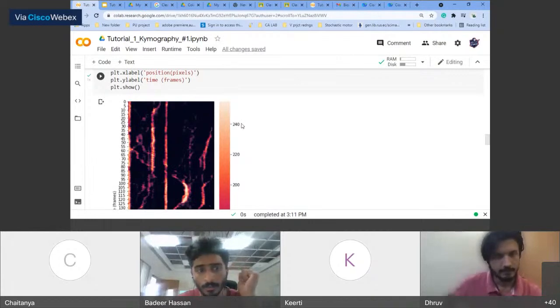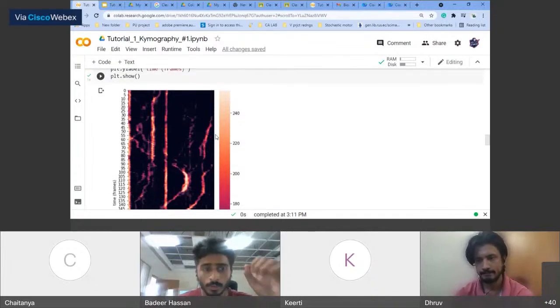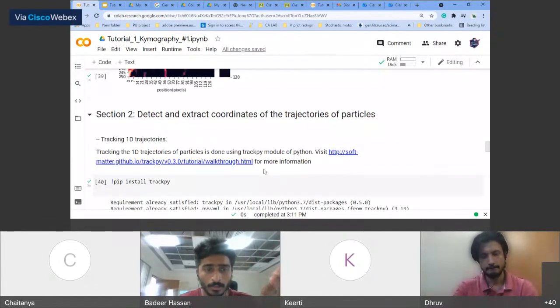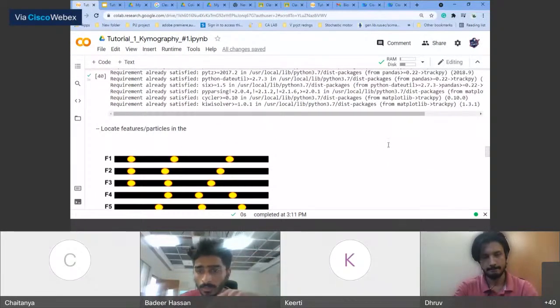As of now, we haven't looked at the whole time series at the same time. We are looking at each time frame individually, and we only care about how many bright spots are there in each time frame. I will come to the algorithm for how the tracks are produced later in the part. We also have some other arguments that we can change to consider the case Amal mentioned.